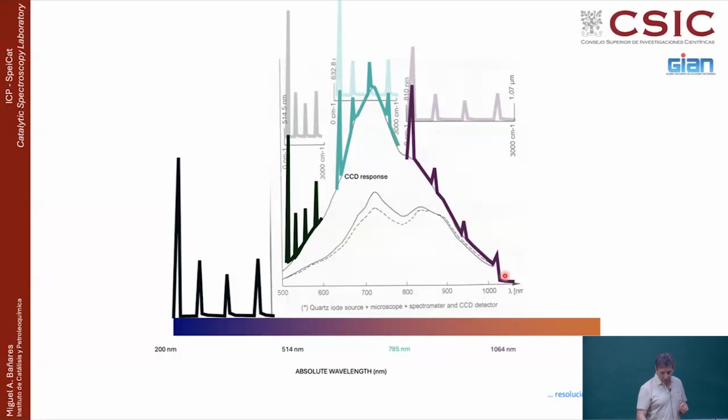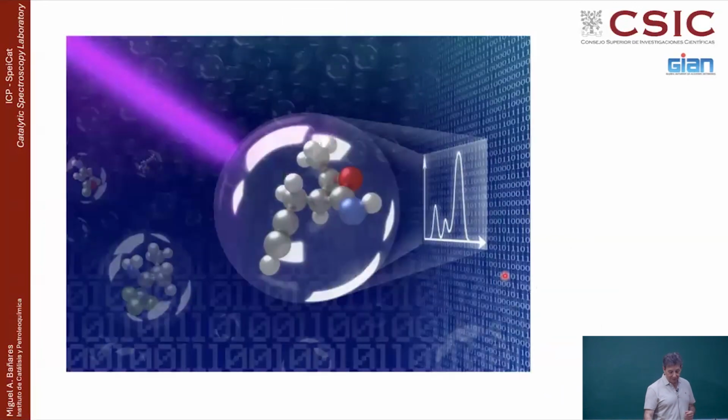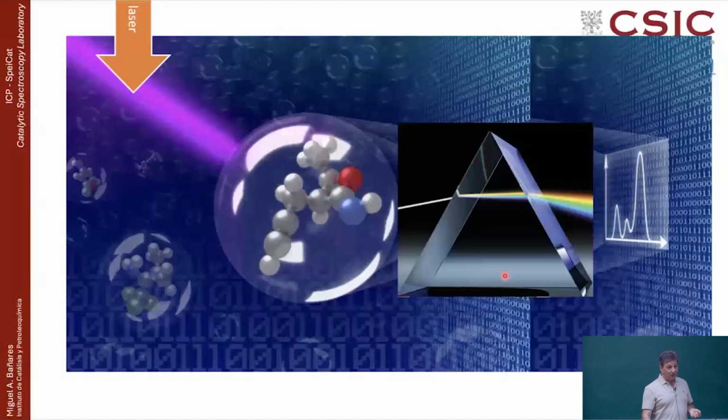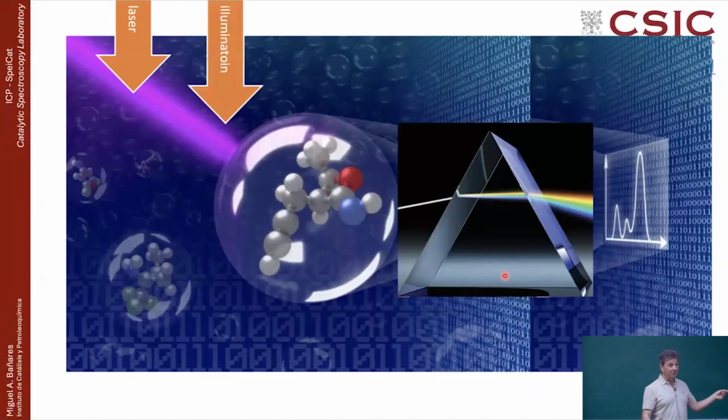Now imagine that you want to certify a material, identify it with the Raman bands, position, relative intensity. You have to do something to correct that. There was nothing to correct that. We had a European project we coordinated about harmonization of Raman spectra, basically to take account of this and many other things, because when you make a Raman spectrum, which laser you use has an effect, as you've seen, because the Raman effect can be stronger or weaker. How you illuminate determines how well you collect things.